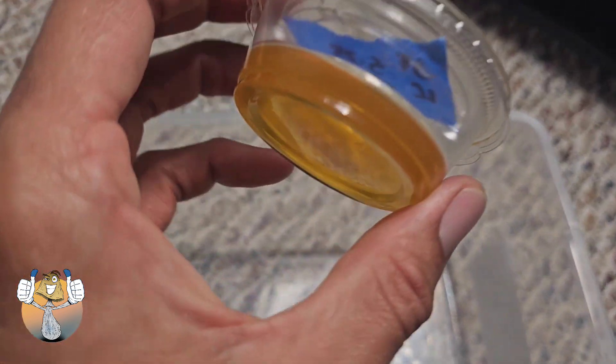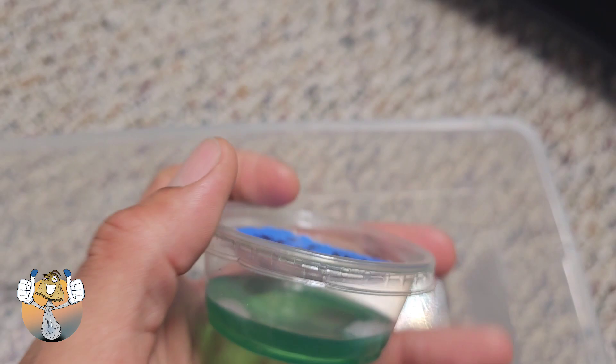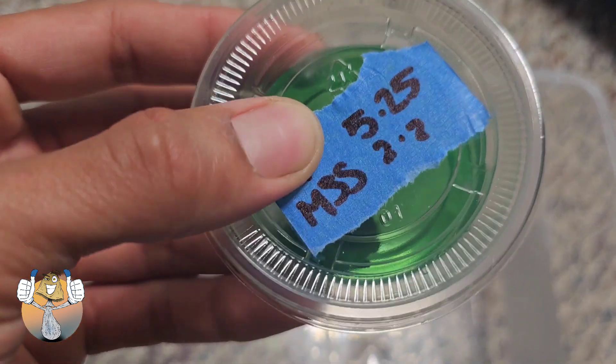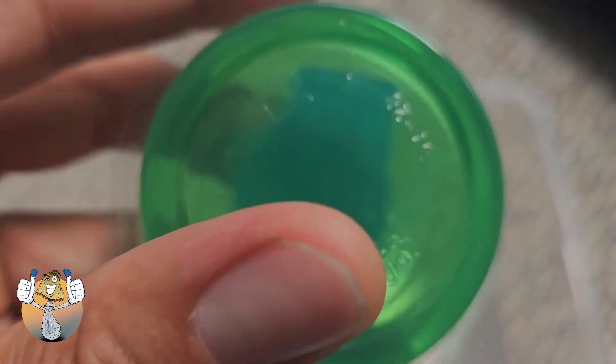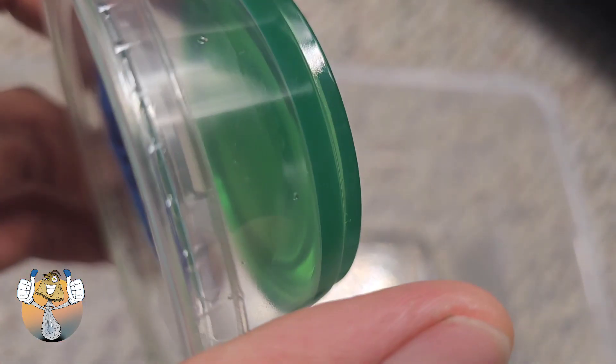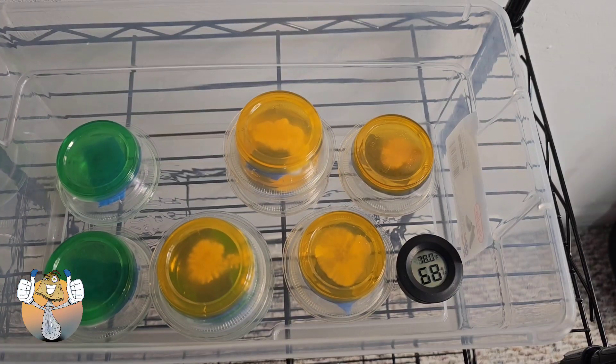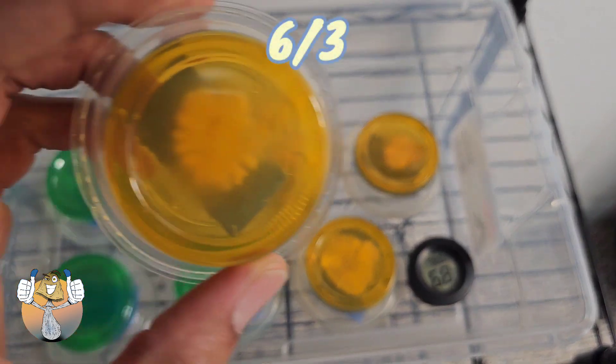So cool. I can live on that island, just sit there with a coconut. So far so good on the liquid cultures. That's expected. Well, I was at least. And we got the multi-spore, just a little bit of mycelium, little clouds along the edge. I'm honestly not expecting too much out of this. I have some growing right now in some rye bags, so I know that this is clean. I just wanted to see how long it would take versus a liquid culture. And that last one that gave me a problem with closing the lid didn't have anything on it at all.